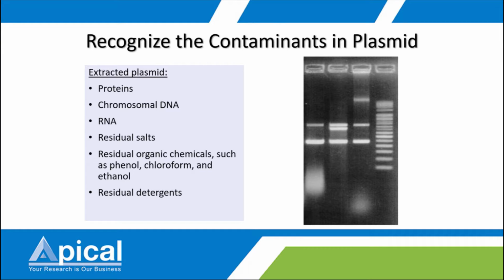All this is leftover from plasmid extraction. For plasmid it is much easier. You just need to use a good commercial kit and follow the protocol, and it should give you a clean plasmid.